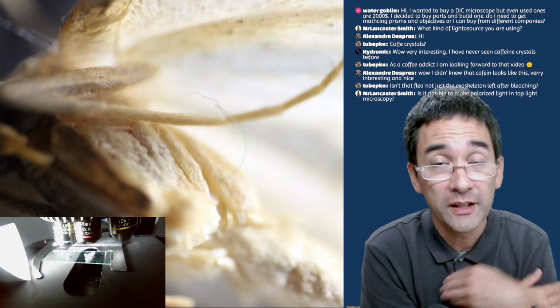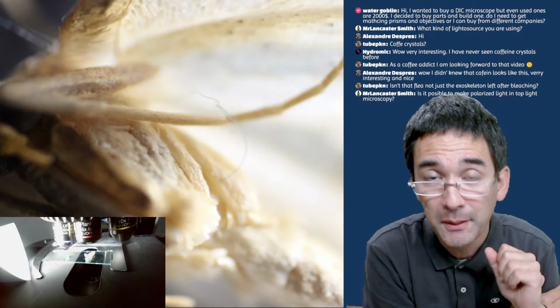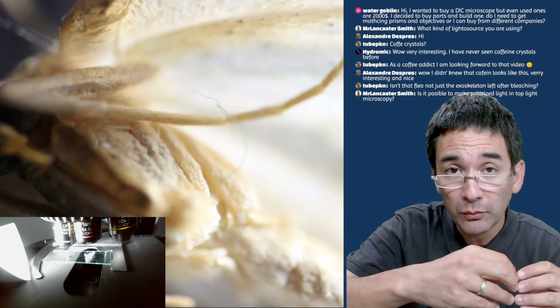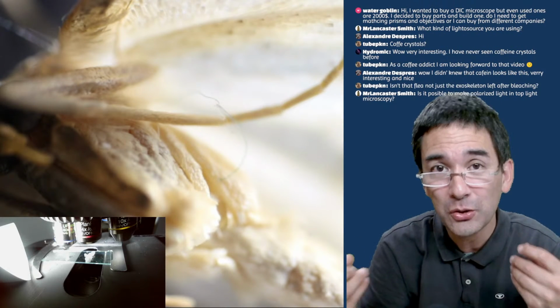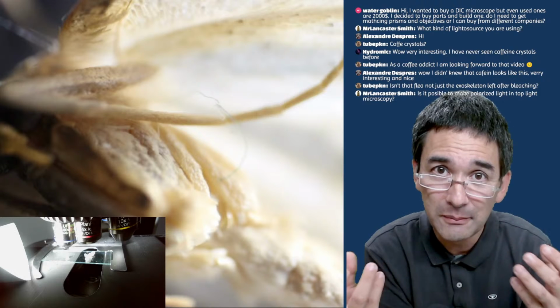Of course, you can shine polarized light on a specimen, but when it hits the specimen, the polarized light bounces off in all directions again. It depolarizes. So I don't think that you're going to see a certain effect. Yeah, so this is a little bit the thing.